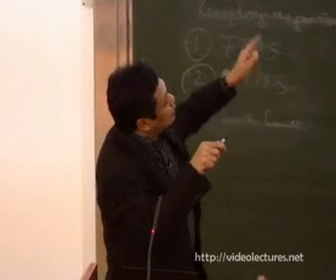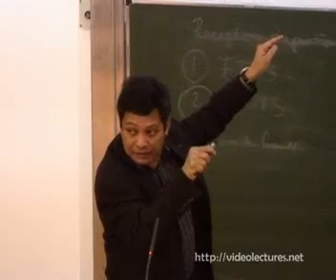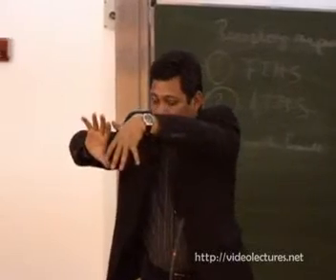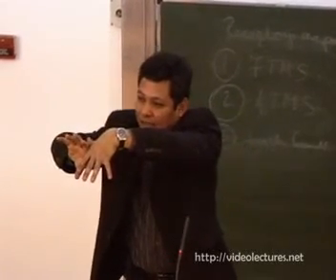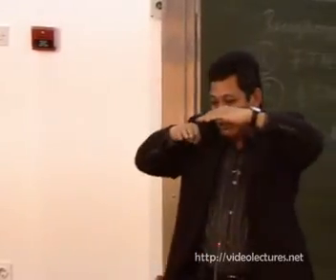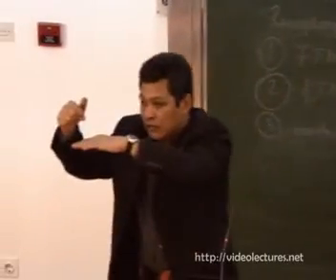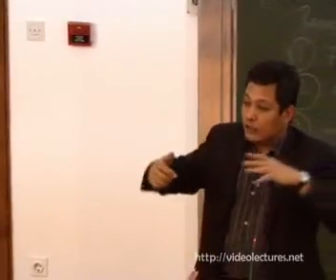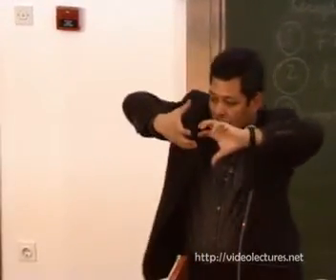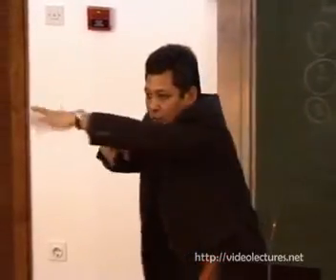So what we did is go in with the tip, distort the molecule, drag it a little bit, and release it. When we distort with the tip, we are actually exciting this twisting mode mechanically. When we release it, it just oscillates like this. Under the tip, the potential is slightly lower than on the other side. So the molecule has a tendency to move towards the tip and move forward instead of backward. It's like a pinion and a rack. This movement is matched with the lattice, so it just keeps moving.